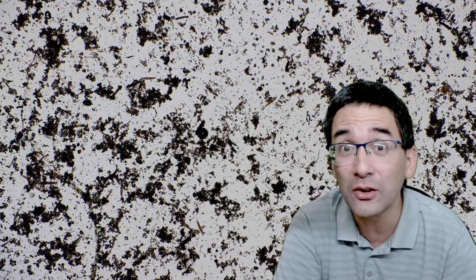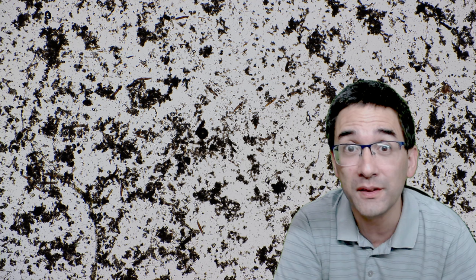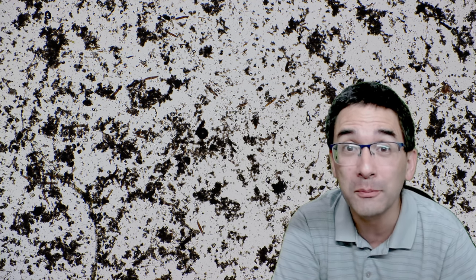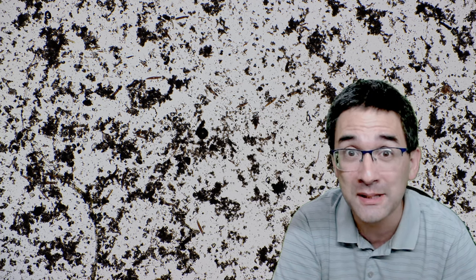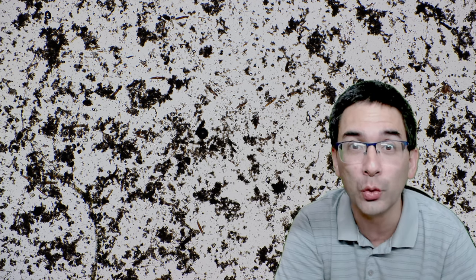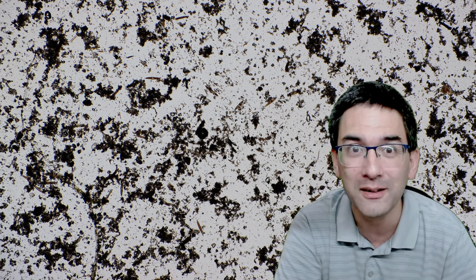But as a matter of fact, there is quite a bit of life on this slide here, and I'm going to show you how you can make the movement better visible by using time-lapse. I'm going to speed up the video 20 times. But first I'm going to show you how I collected this sample, and it's quite surprising what's going on here.